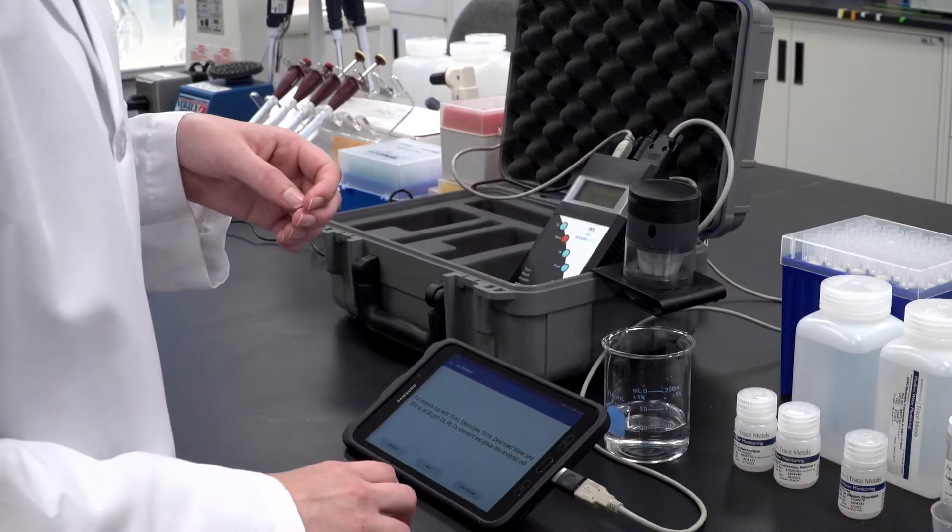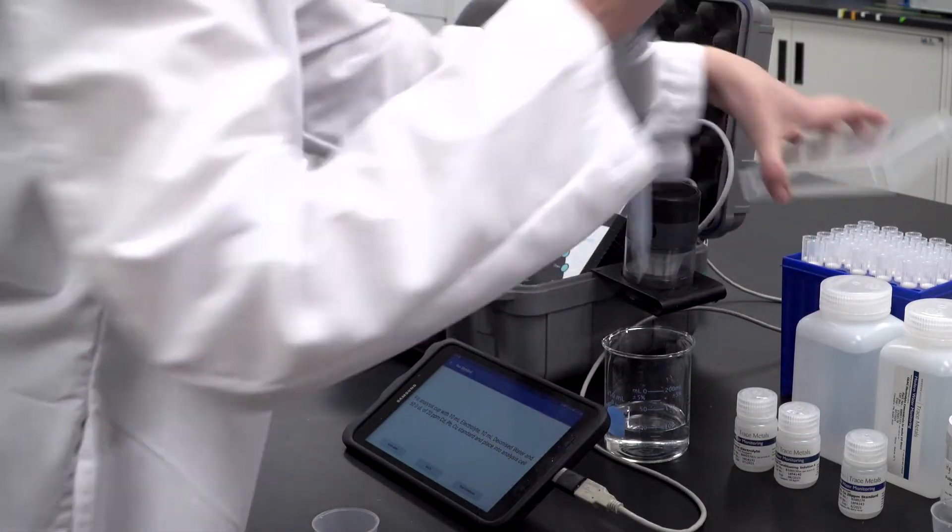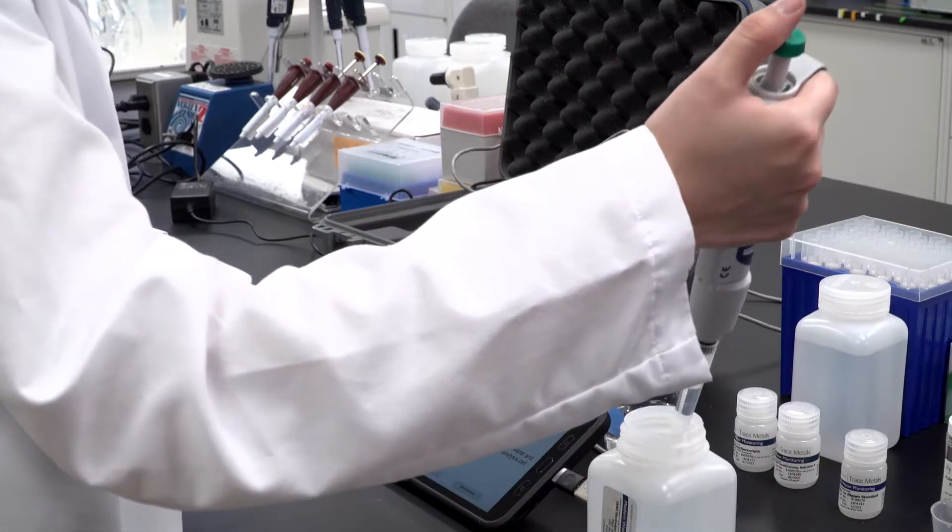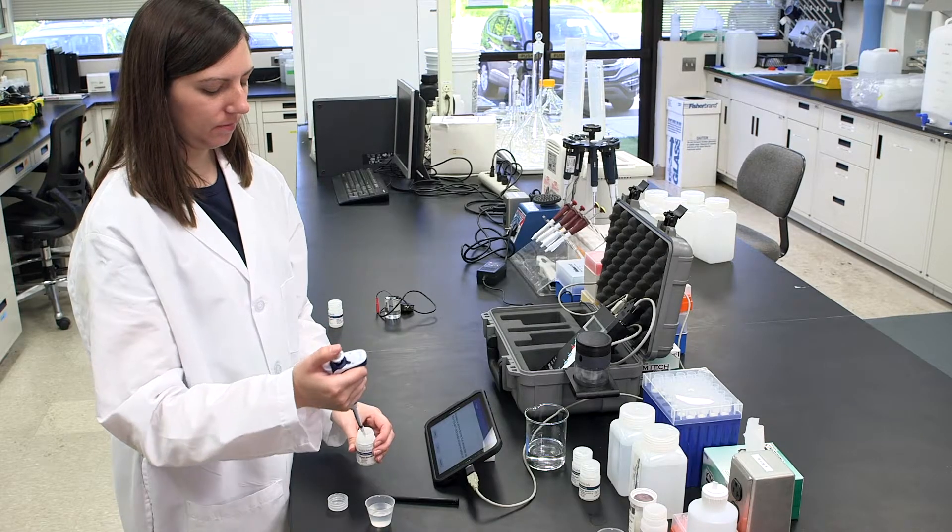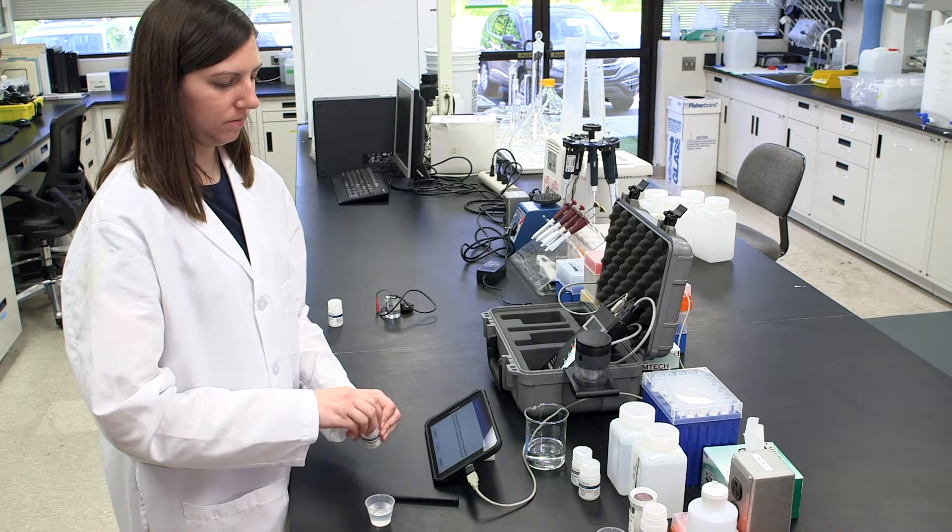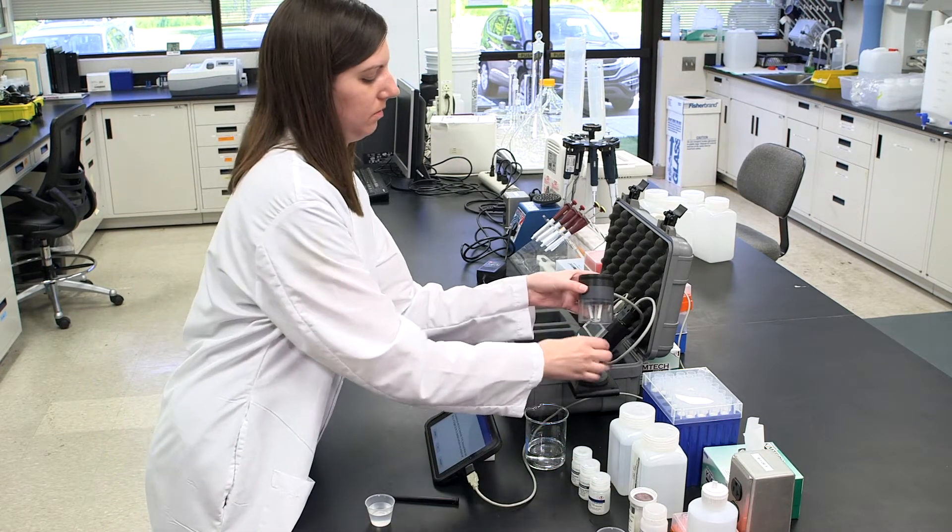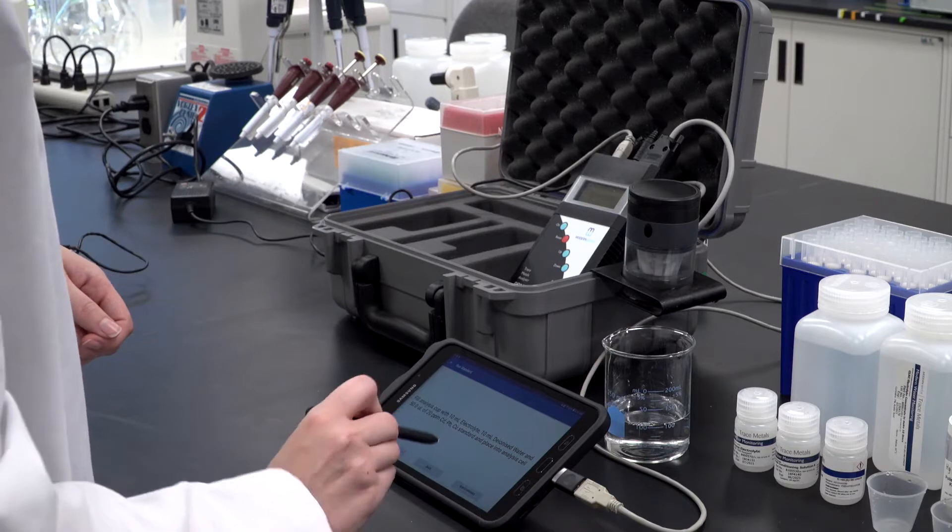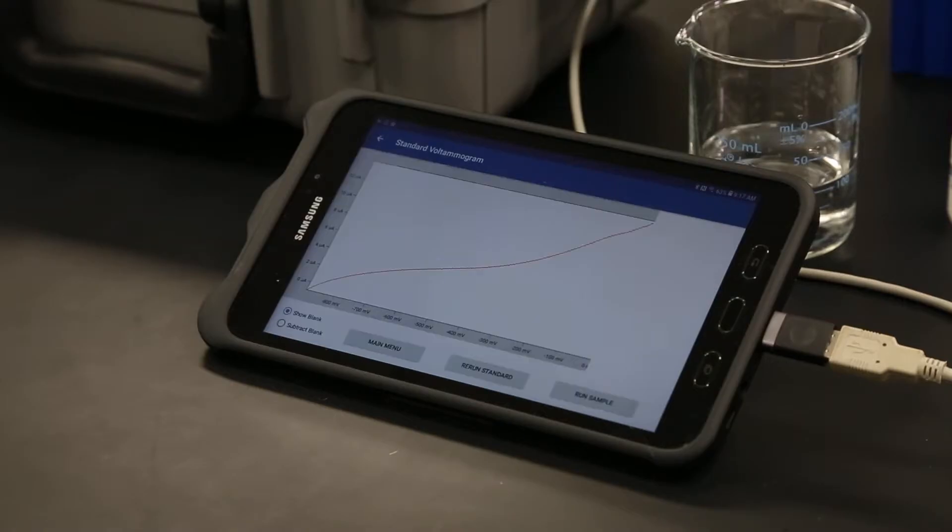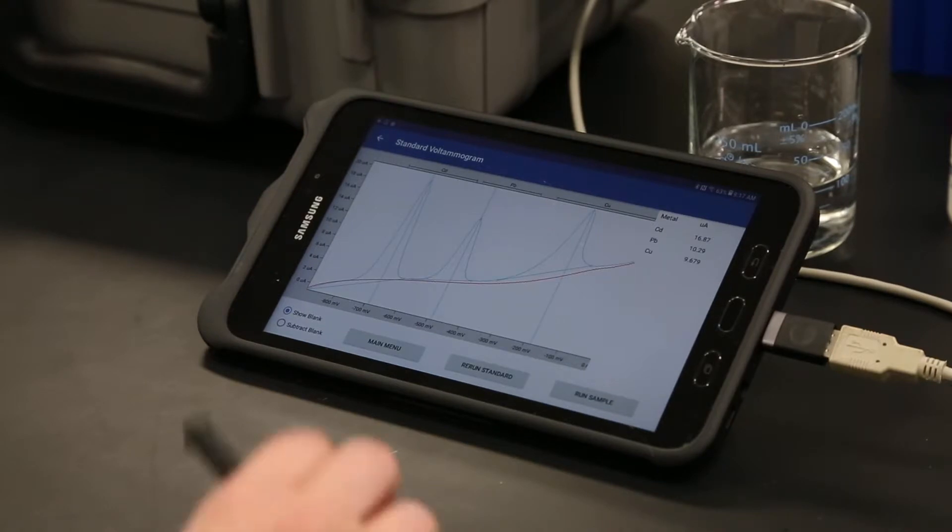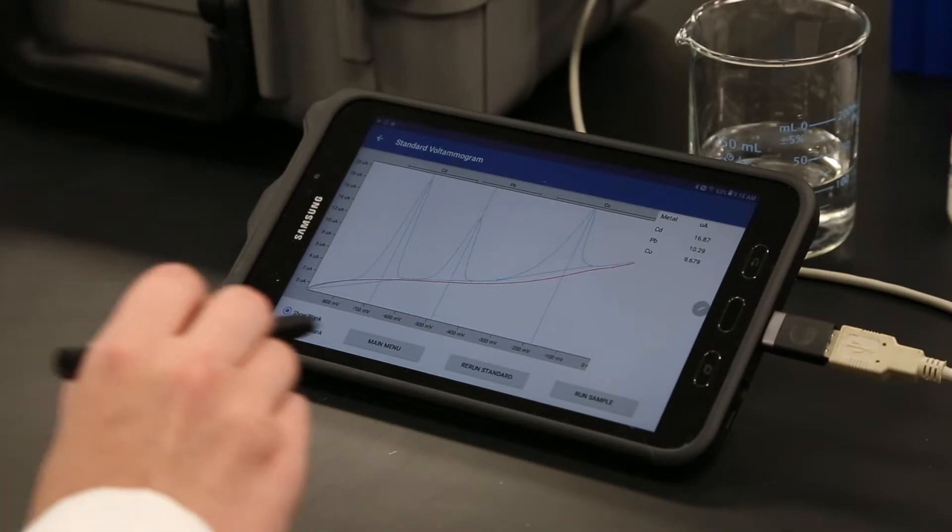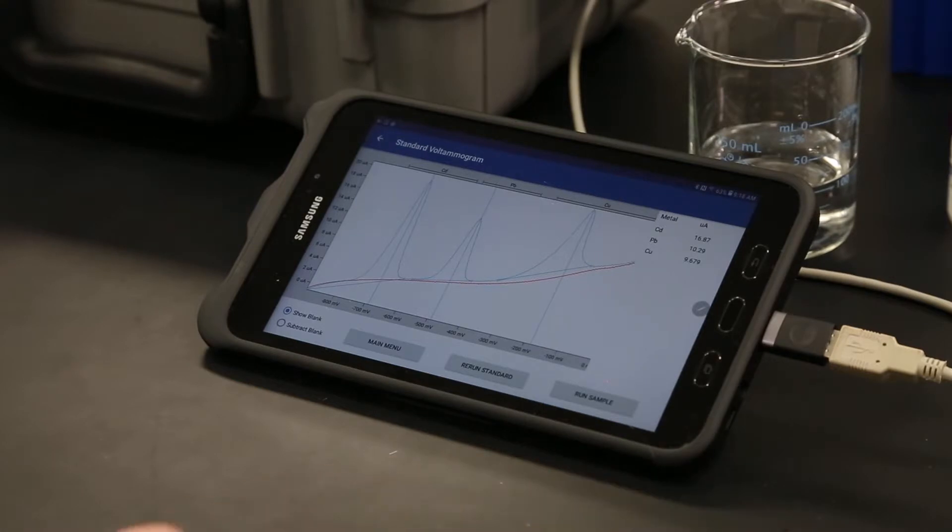In a fresh analysis cup, prepare a standard solution from the volumes given on the app screen. Place the cup in the analysis cell and click the Run Standard button to initiate the standard analysis. Once the analysis has been carried out, the voltammogram will be displayed. The user will have the option to simply display the blank or utilize the blank subtraction option by clicking the appropriate radio button in the bottom left corner. If the application note recommends repeating the standard for better results, this can be done using the Rerun Standard button.